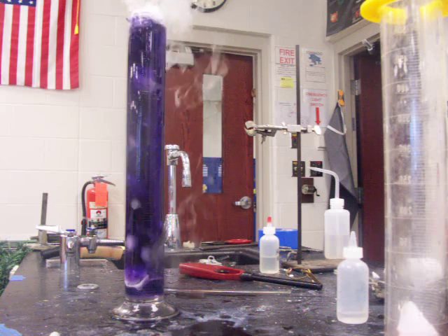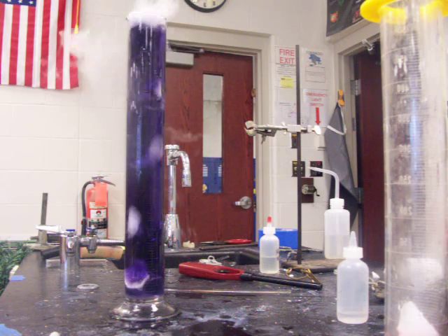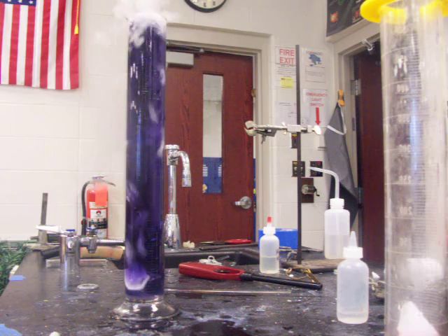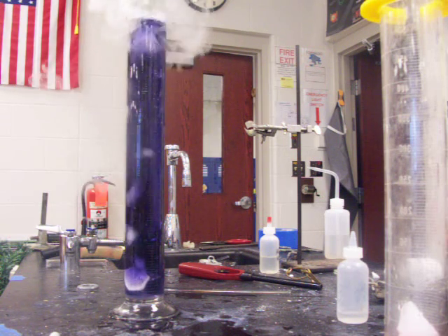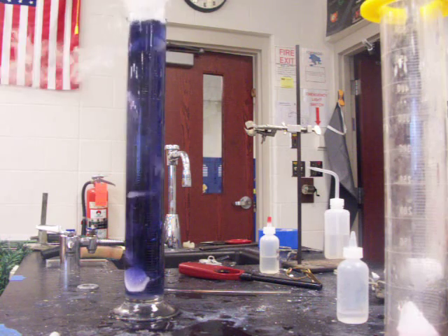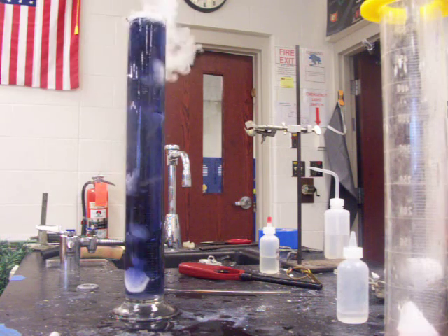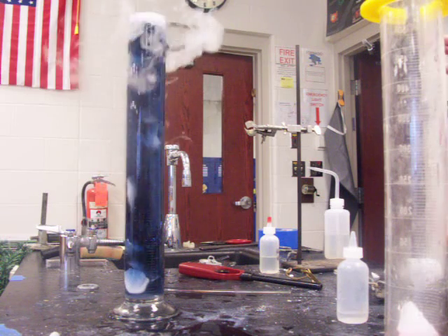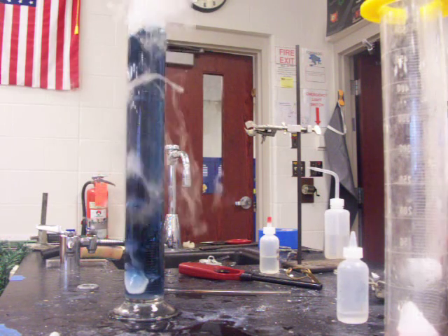The dry ice forms an acid in water — that would be the best way to describe it. Now I added a lot of base to get it to the base region, so you can see it's taking a little longer to get into the acid range. But here we're going from the purple into a turquoise or blue color.